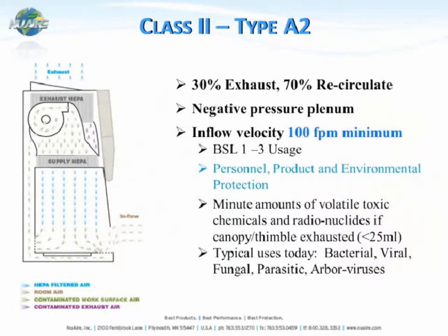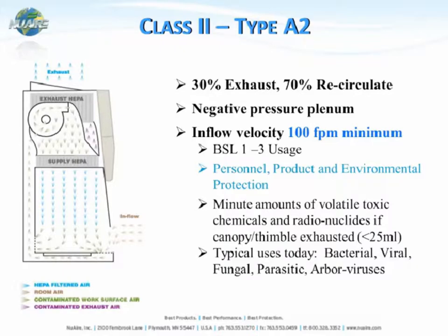Instead, the most common is the Class II Type A2. It's very similar in design in that 30% of the air is exhausted and 70% is recirculated. But the biggest difference is the inflow velocity, which is 100 feet per minute minimum. This allows use in BSL levels 1, 2, or 3. Instead of just non-volatile toxic chemicals, you can use minute amounts of volatile toxic chemicals in an A2 cabinet, as long as it is exhausted to the outside.